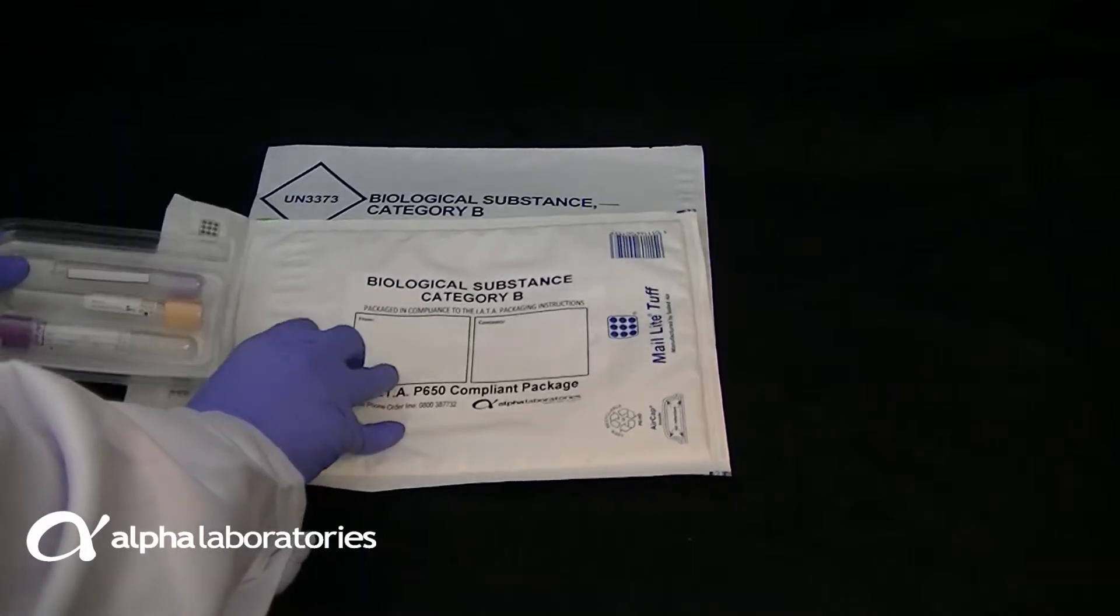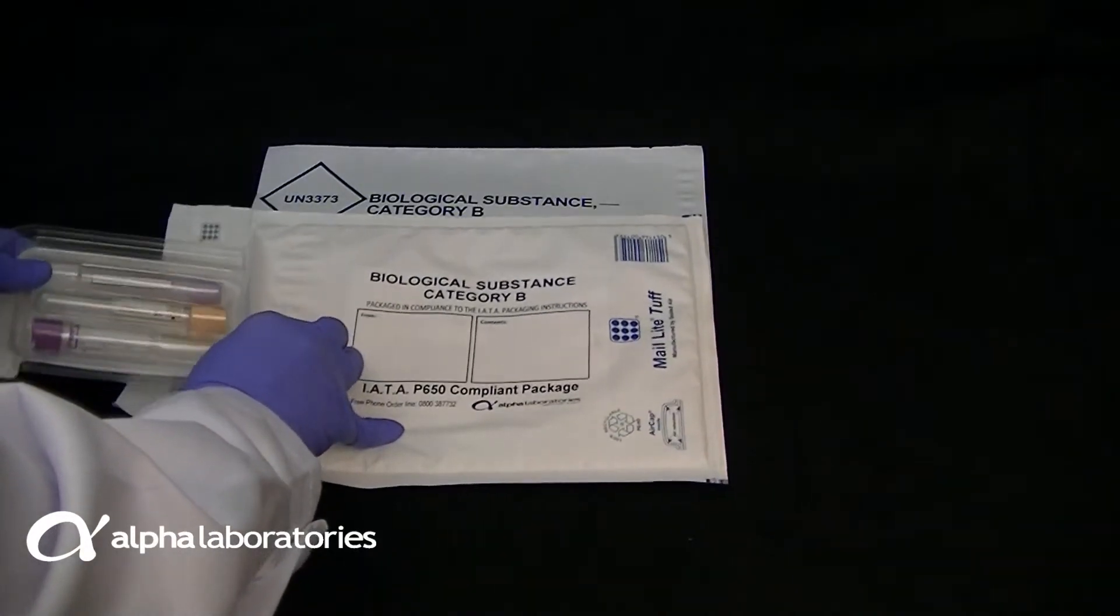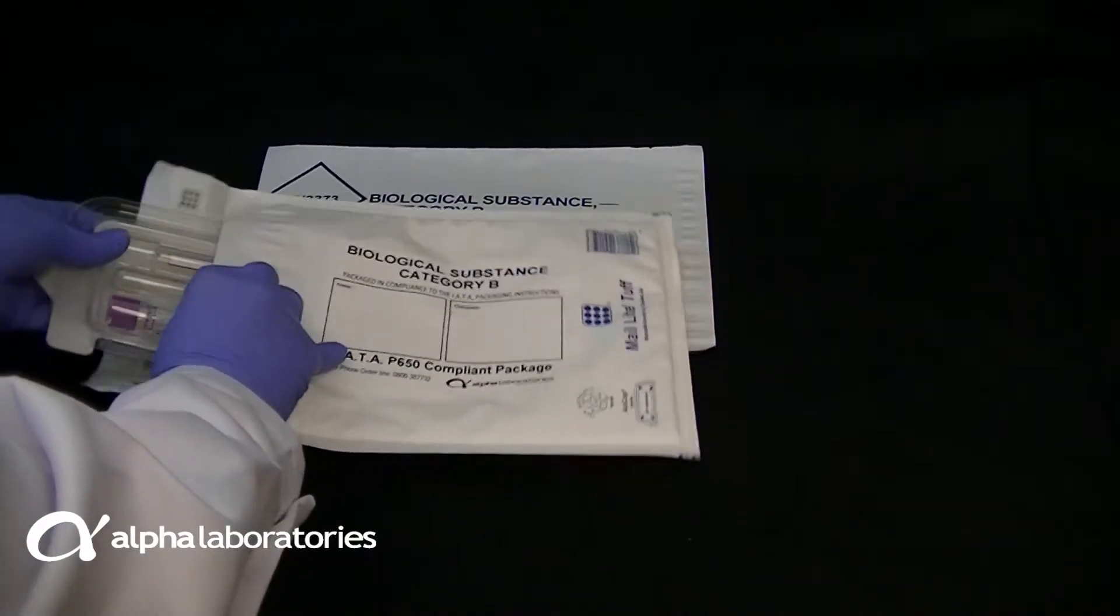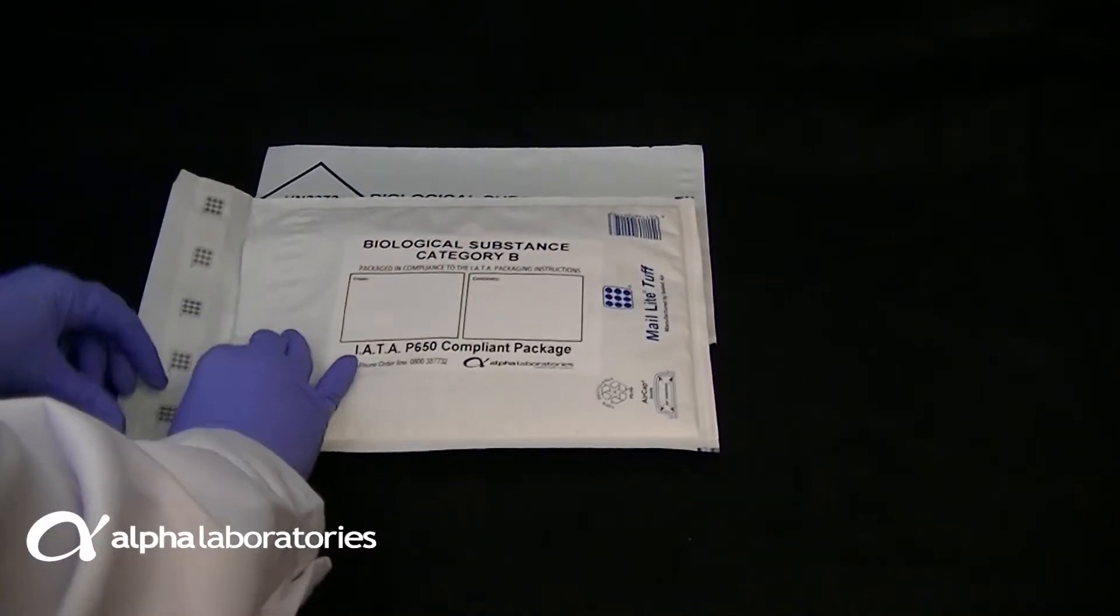Alpha Laboratories can provide complete off-the-shelf solutions including mailing envelopes which are already labelled to UN3373 standards.